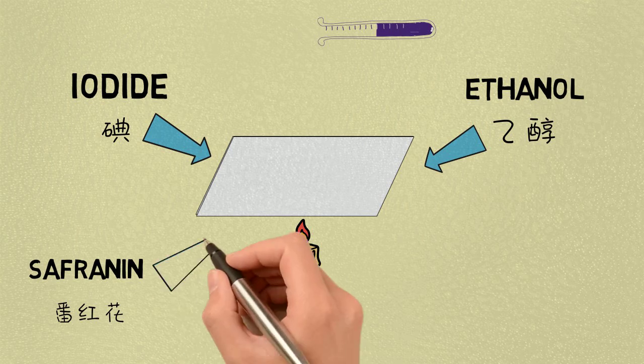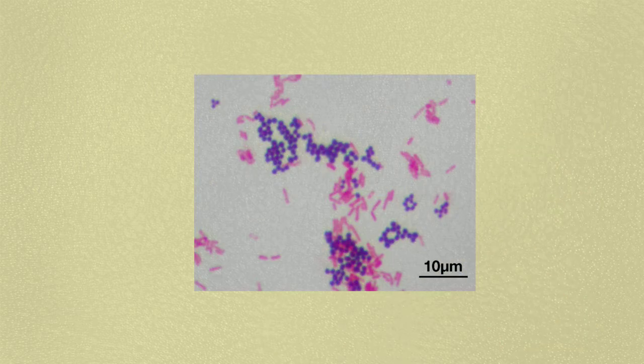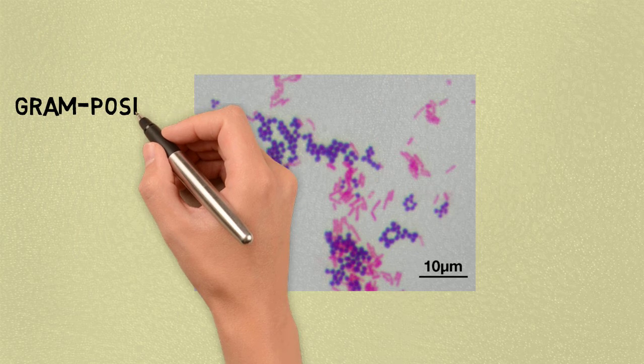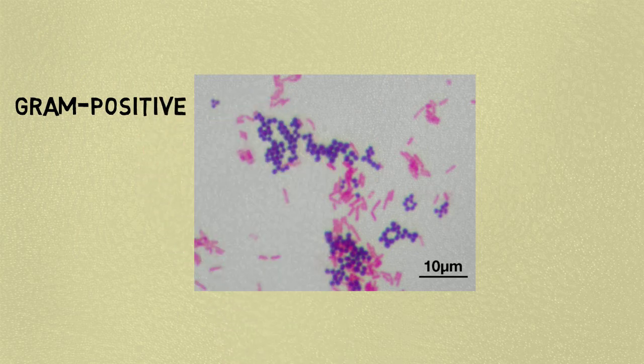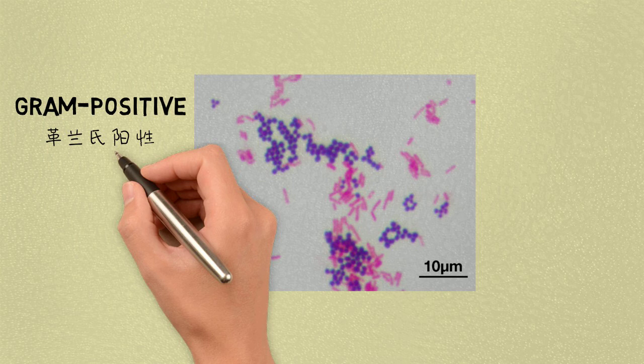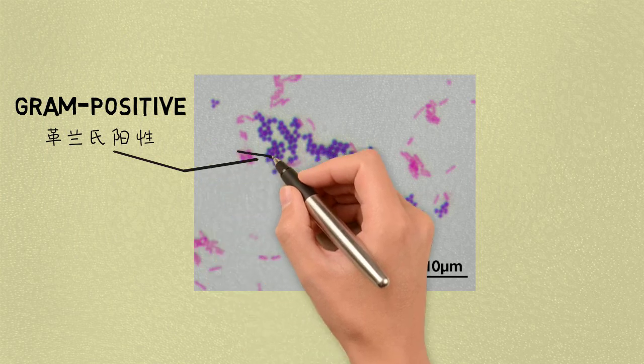Crystal violet, CV, dissociates in aqueous solutions into CV+ and chloride, Cl-, ions. These ions penetrate the cell wall of both gram-positive and gram-negative cells. The CV+ ion interacts with negatively charged components of bacterial cells and stains the cells purple.